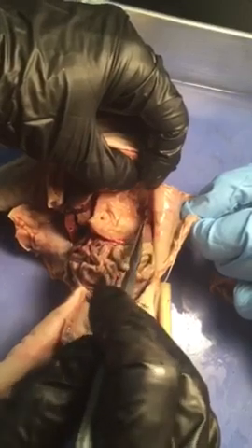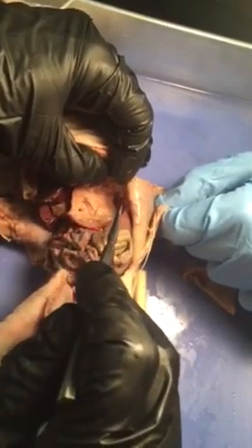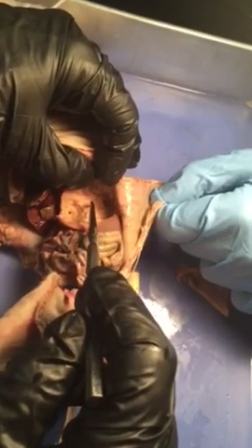All right, so where's the esophagus? Because the esophagus has to enter in, right? And you almost can't see it. It's not as clearly defined because it's not actually a true sphincter muscle. It's kind of nice because here's the esophagus where it enters, and here's the pyloric sphincter. Now, we call it the cardioesophageal sphincter, but it is not a true sphincter muscle. And you can clearly see there's a difference.